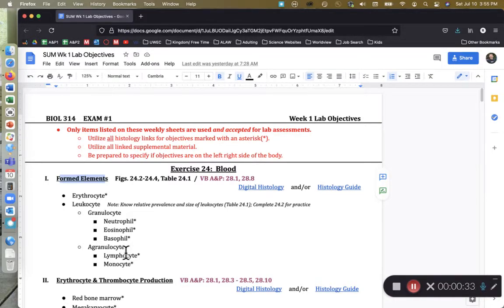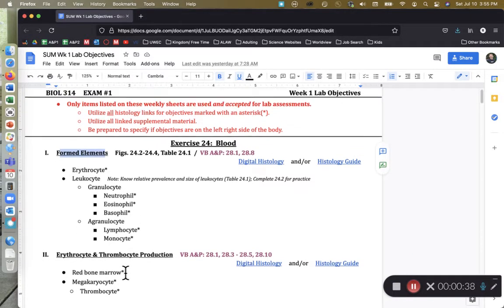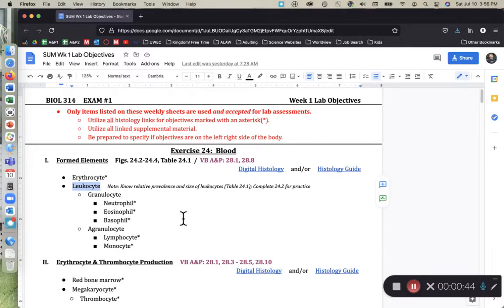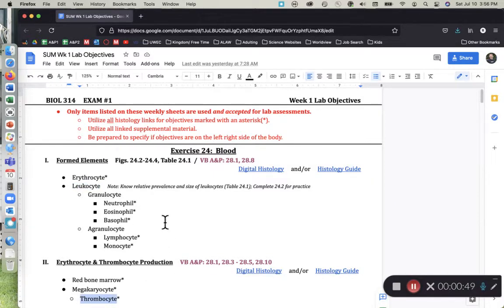We have erythrocytes, leukocytes, and thrombocytes. Erythrocytes are also known as red blood cells. Leukocytes are also known as white blood cells, and thrombocytes are also known as platelets.